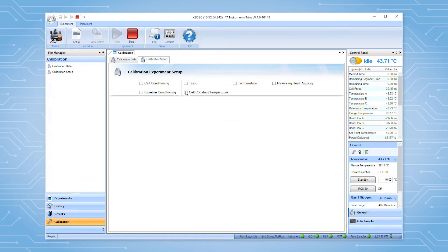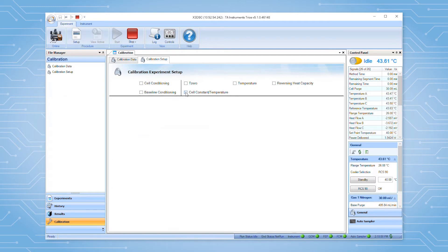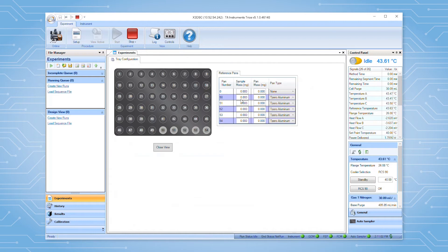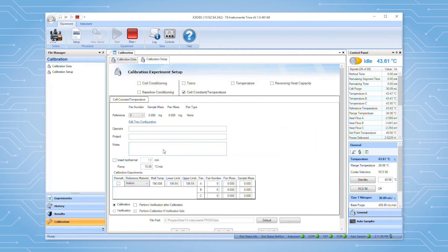Select the cell constant temperature calibration by checking the box next to the appropriate label. Click the edit tray configuration link to enter the information for the reference pan. Click close view to be taken back to the calibration setup page.